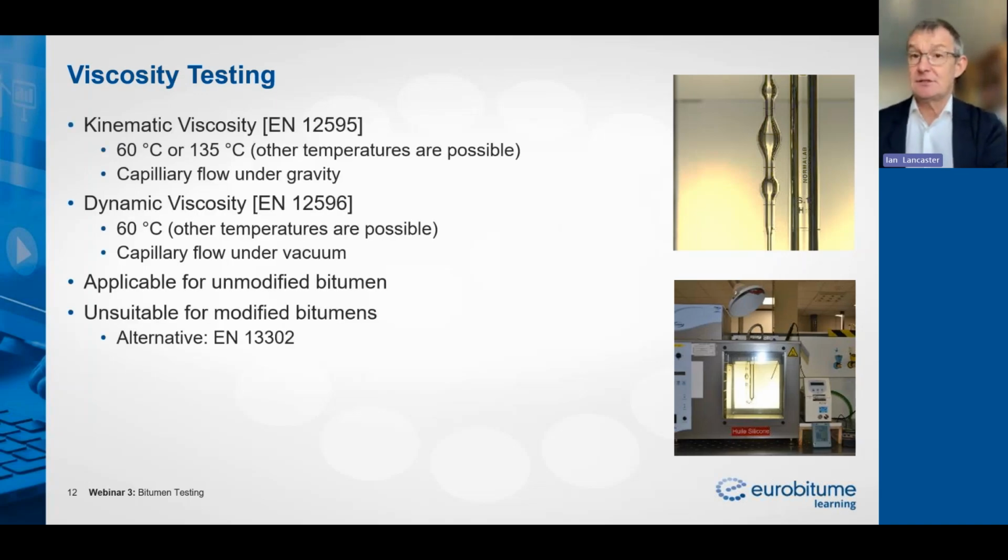Next, we look at viscosity. And viscosity is a very interesting concept. There's a reasonable argument to say that it's probably one of the most important properties of bitumen to understand, because it governs almost everything that we do. It governs the temperatures at which we pump product around. It governs how we coat aggregate to make asphalt, or filler to make roofing felt, or waterproofing membranes, and it's a very, very important part of our understanding of the behavior of bitumens.